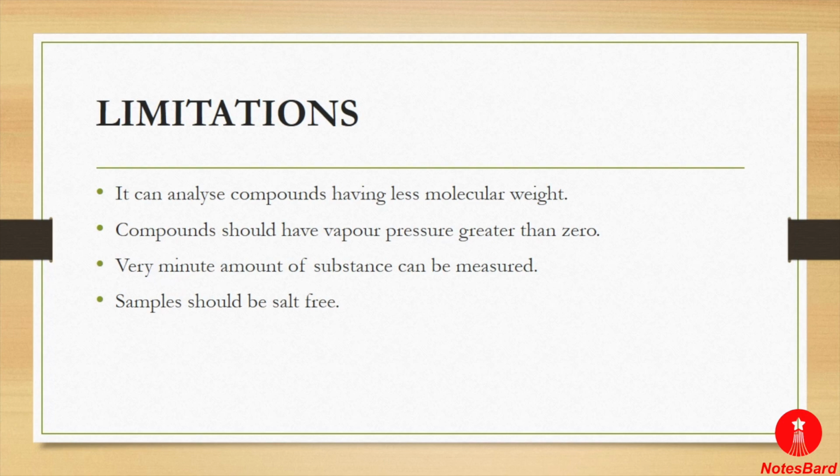So in this video lecture we have discussed gas chromatography, its procedure, its applications and its limitations.